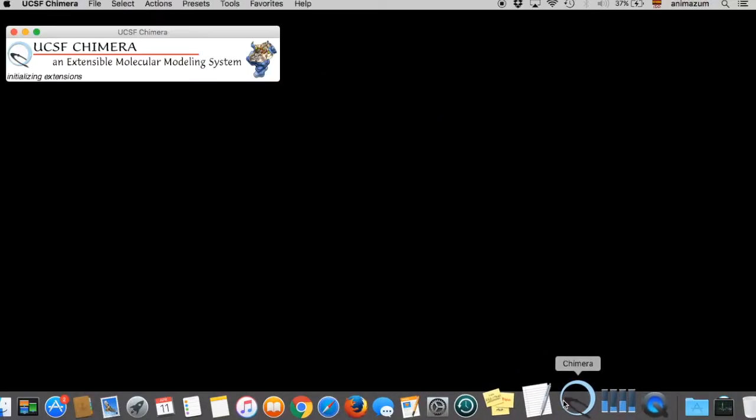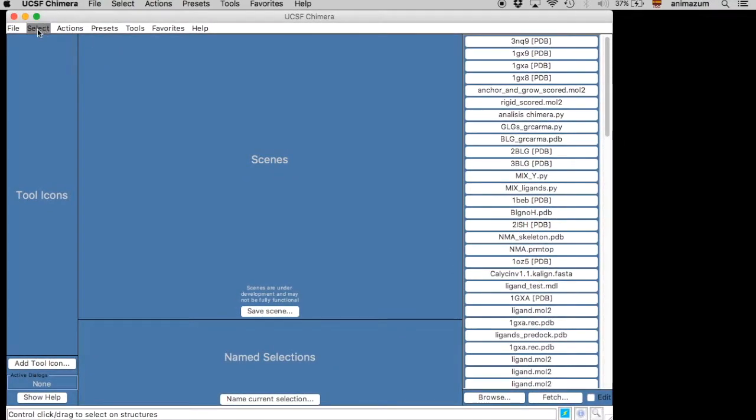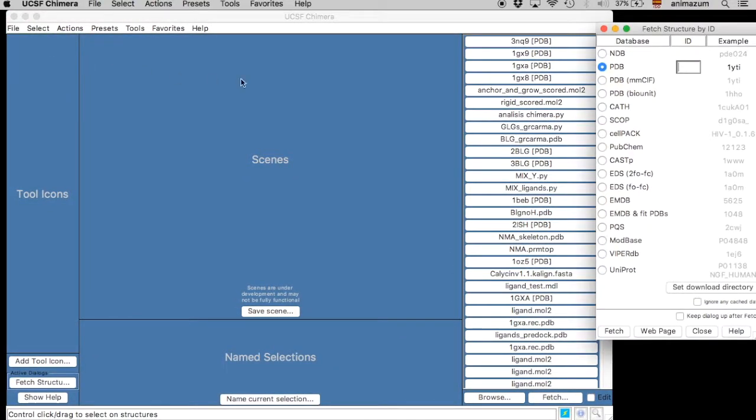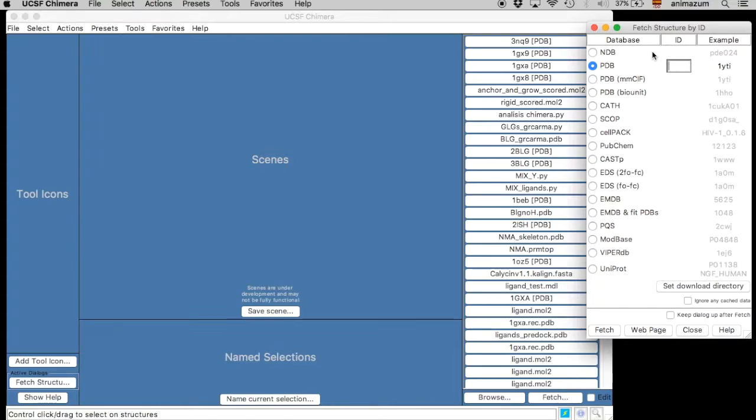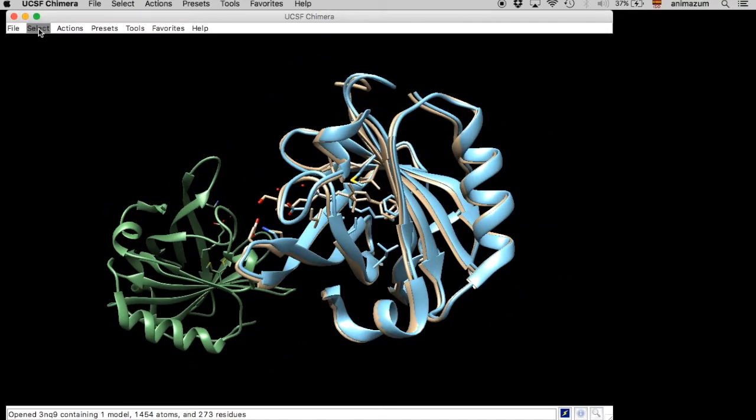We open Chimera and then we fetch the proteins by their PDBID. We are going to use some beta-lactoglobulins, or BLGs. It's a protein that I used for my bacterial science thesis. Here they are — it's a protein from milk.